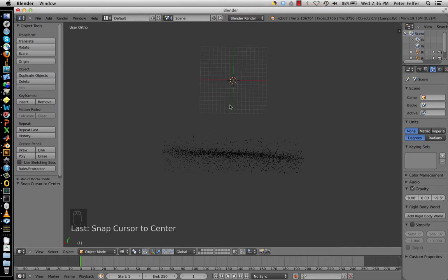And we want that so that later when we are manipulating our objects, which we might do for animation purposes, or if you want to use it for reconstruction or other purposes, it's good to have all of our objects initially at the same position.